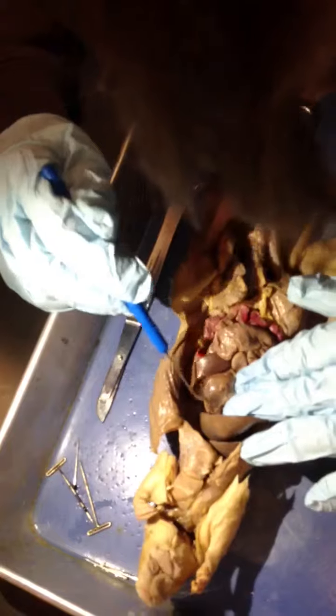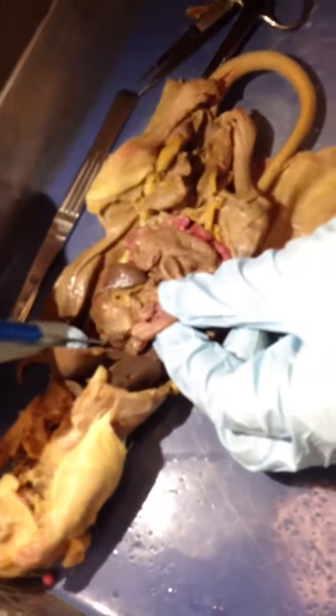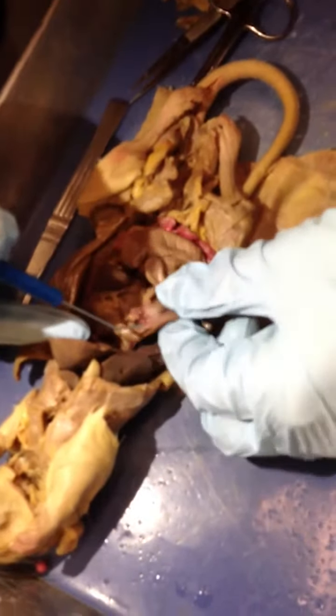Then the part where the esophagus, right here's the esophagus, right there where it goes is the cardiac portion. And then the portion where it connects with the pyloric sphincter and the duodenum, that's the pyloric portion, right here. Then this little band going right here, that's the pyloric sphincter, so that regulates what goes into the duodenum.